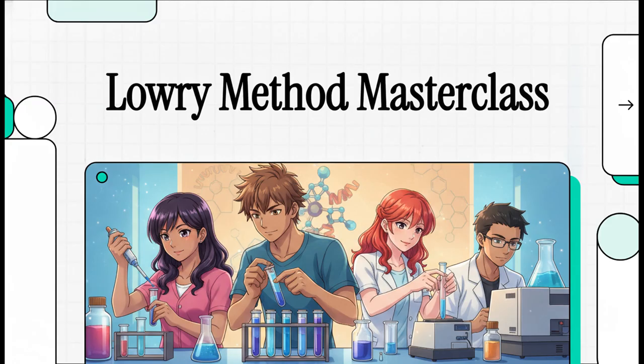Acting as your personal Dr. Chem, I'm going to walk you through a complete step-by-step explainer on the classic 1951 Lowry method for protein quantification. We're not just skimming the surface here. We're giving you the complete experiment with full necessary experimental details. Whether you're literally prepping to hit the lab bench or you just appreciate the pure elegance of chemical assays, this one's for sure going to be a masterclass.